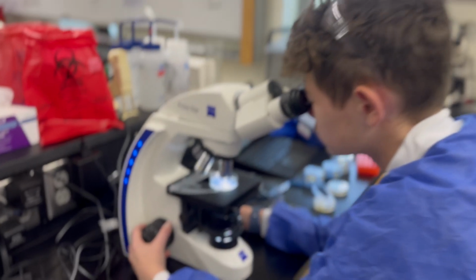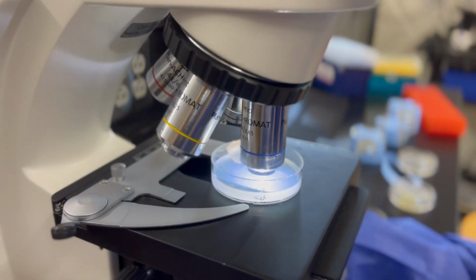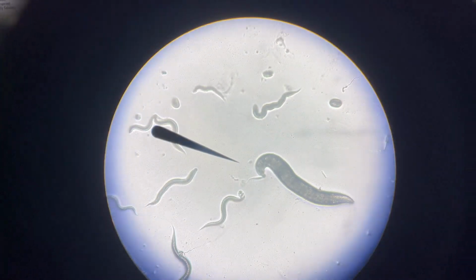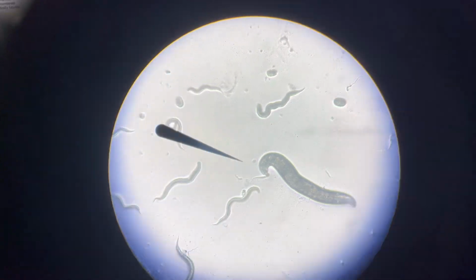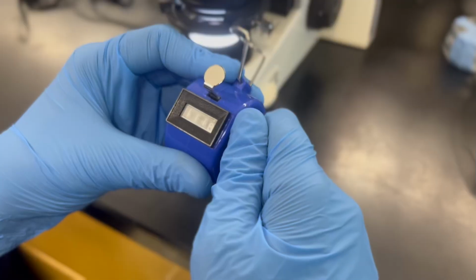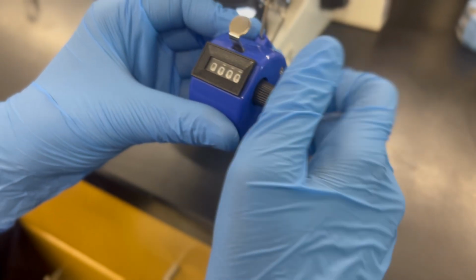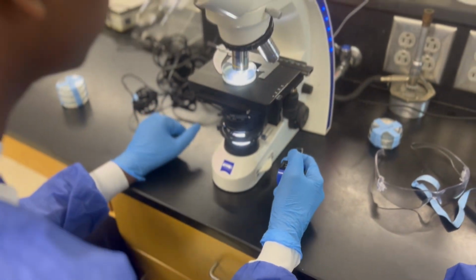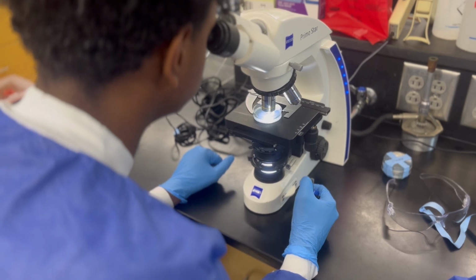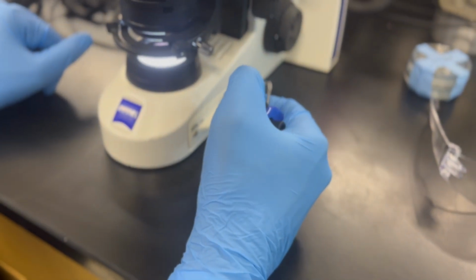The overall goal of this experiment is to test the effects of varying glutamate levels on motor functionality. Under a microscope, you can just see the worms squirming around. The wriggling test is pretty simple. We just compare the movement behaviors of each of the worm strains under the microscope focus, and then use a clicker, or a device that manually tracks the number of iterations by the end of the timing period. Here, we basically have a rate of 1 period per left and right movement, and worms move literally like a sinusoidal function, so it's pretty consistent so far.